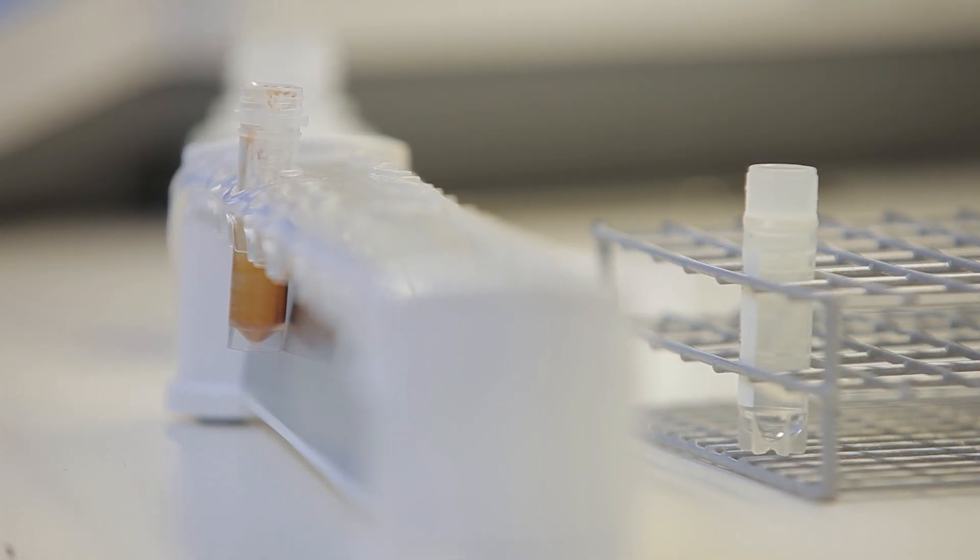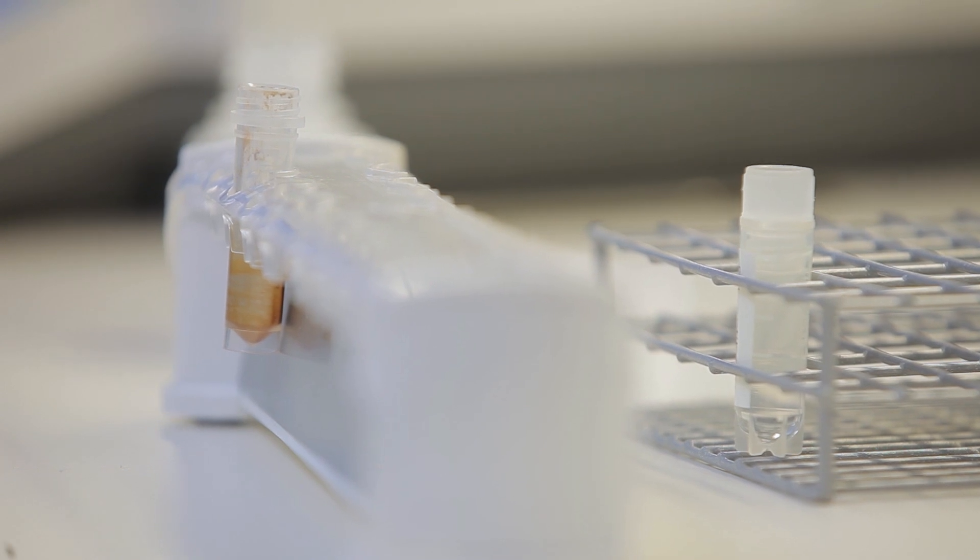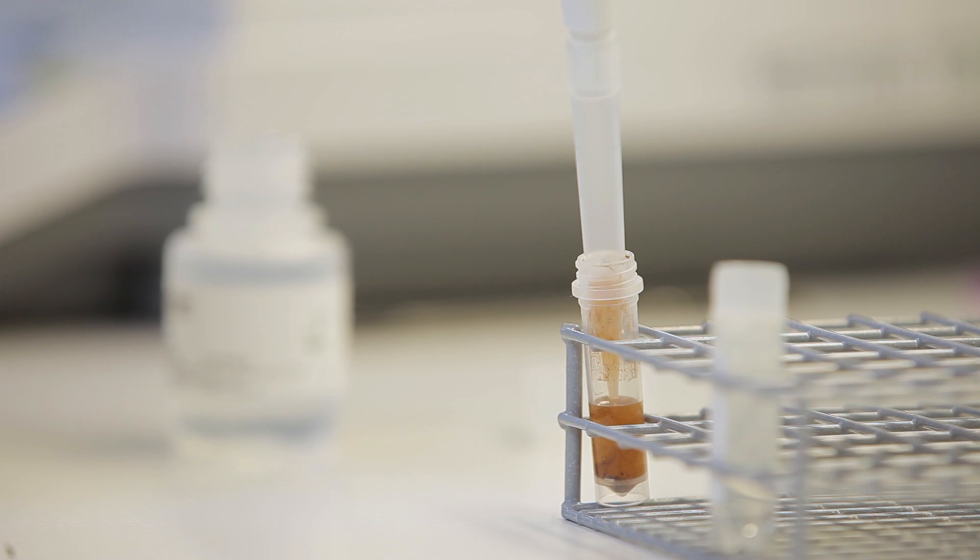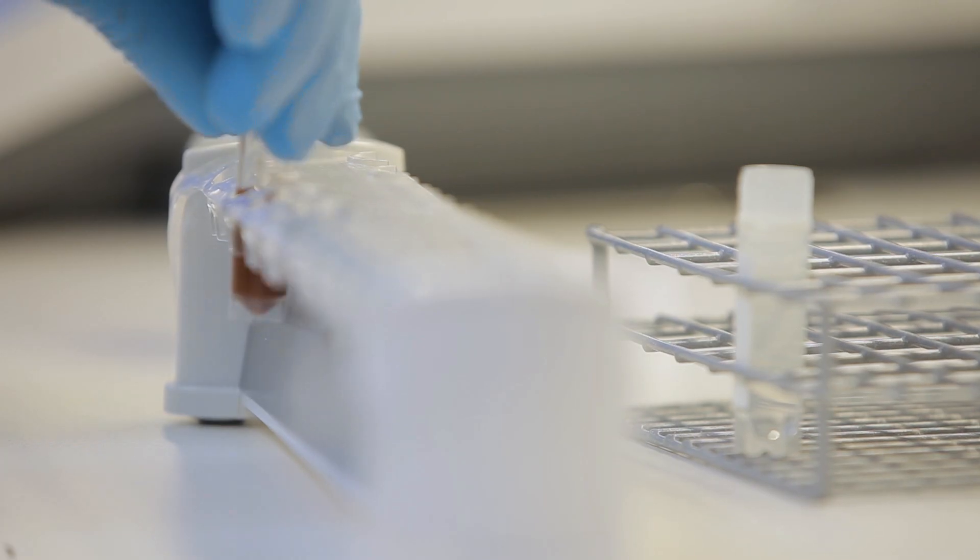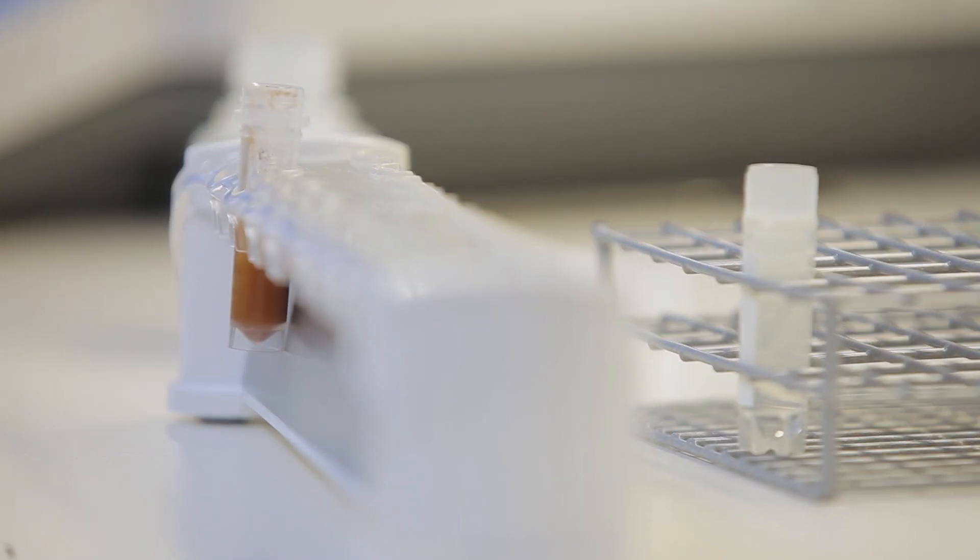Wash the beads once using C1 buffer. Mix the beads and buffers gently by pipetting or vortexing for a few seconds. Place the tube in the magnet for two minutes to collect the beads and remove the supernatant.